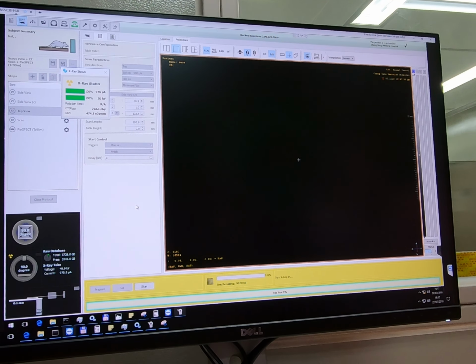step. So first, the first parameter is the number of projection. These are again just a default drop-down list, so it's really flexible in the protocol editor. You can define any kind of projection number. What do you think is the highest you can have? What do you think the maximum projection number can be? Which is possible with the system. The 720 projections.